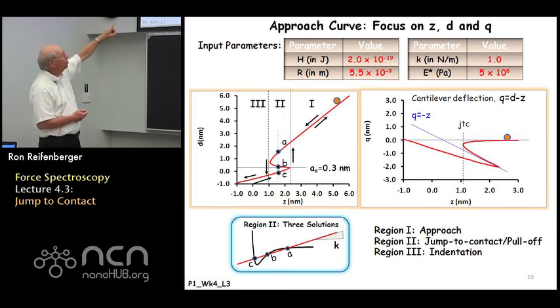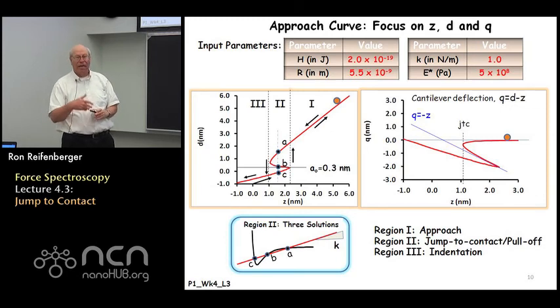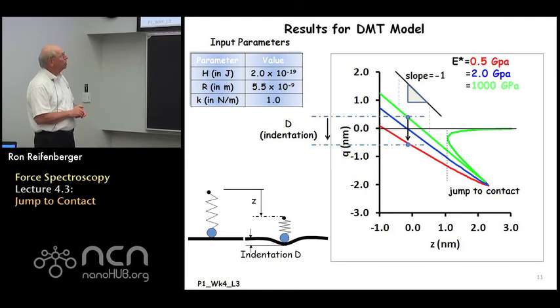So these curves were generated using the parameters that I list on the upper part of the slide, and they give you an indication of how Veda is going to calculate displacements of cantilevers for different choices of parameters. And I'll end the lecture with another slide that illustrates the utility of these types of plots.